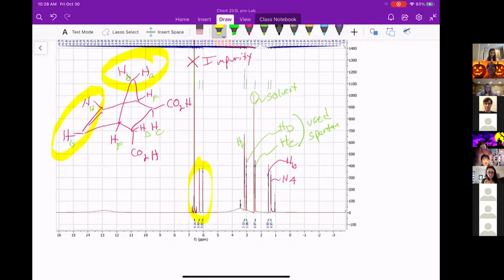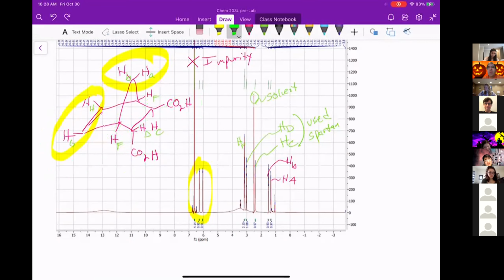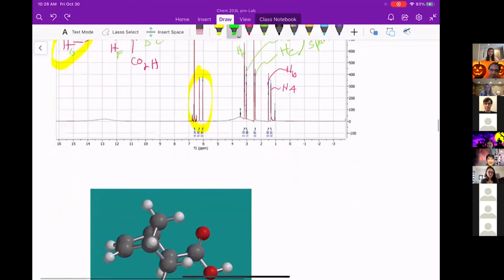So why is it that in this molecule, where you have one carboxylic acid up and one carboxylic acid down, that affects the protons on the entire other side of the molecule, right? I'm talking about these groups over here affecting these over here. They're like way away from each other. Or are they? Dun, dun, dun. Sorry, sound effects too. Let's look at the molecule.